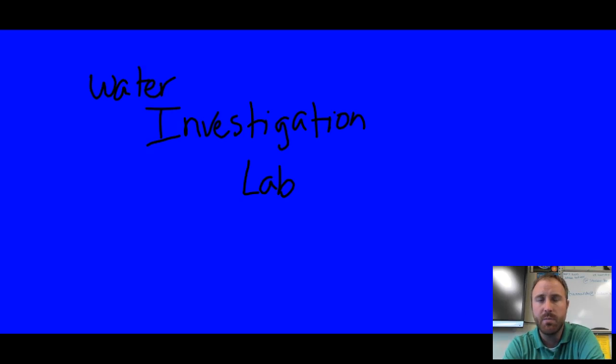And the question that was posed to start with is whether or not you thought that adding salt to water would increase the boiling point. We gave an example of making macaroni and cheese, and whether or not some people use salt to speed up the process of cooking, and some of you did, and some of you said, no, we don't do that. And so we thought it would be a good starting point to look at whether or not it is worthwhile to use. And so let's take a look at the lab that we did.